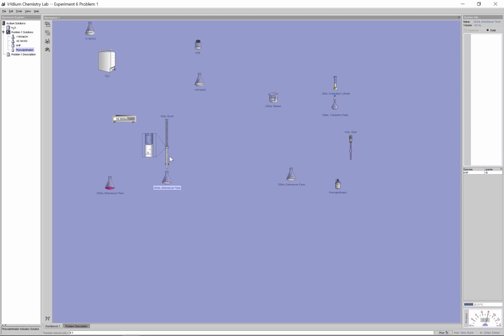I just record this on the side so I can tabulate for you later on. If I just did a subtraction right now and figured out approximately how much solution is in there, it's only 9.79. So the 10 mL was overshot here. 9.79 sounds better. I want to see if my third trial here is consistent with that.